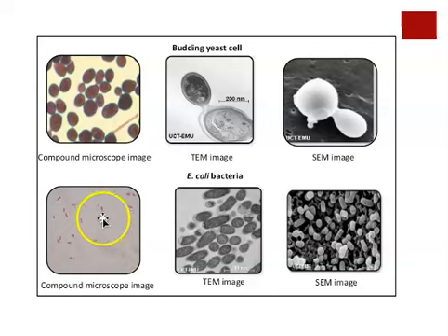We're looking at these cells under the 100x lens. They're tiny, even under 100x. Now compare that to what we would see using the transmission electron microscope. Much, much more detail seen in each individual cell. And of course, when we look at the SEM image, now we're looking at the surface of these bacterial cells. Really amazing, the amount of detail you get with an electron microscope.